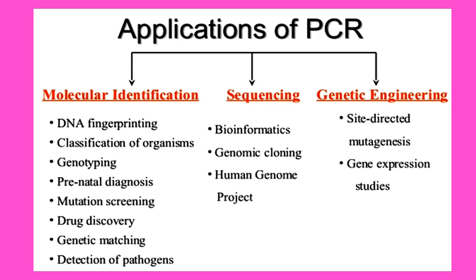This includes several important points. Pathogens such as microbes, bacteria, viruses, such as coronaviruses, all strains, HIV causing AIDS, and HAV, HBV, and HCV, which cause viral hepatitis.